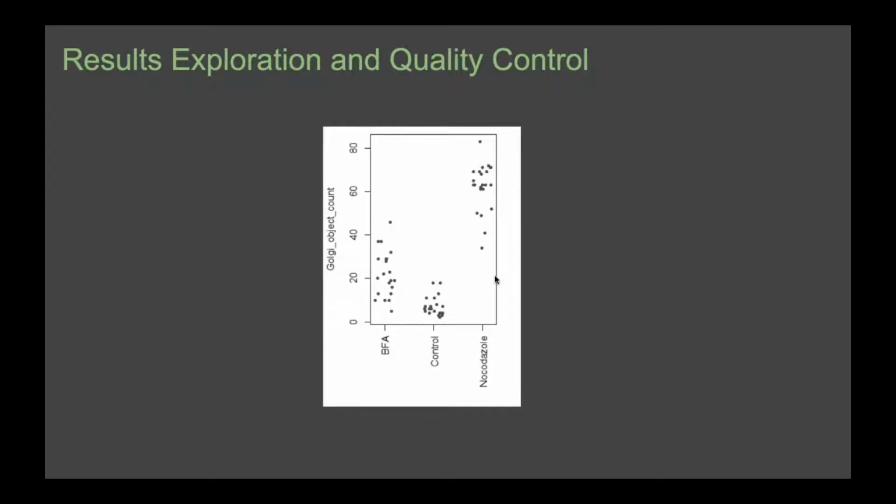Okay. Could you elaborate more about KNIME? Is it user-friendly or is some basic programming required? Unfortunately, I don't have a screenshot. It is user-friendly, so I think if some people have used LabVIEW, maybe not. So you don't have to write any code. In the end the workflow is little graphical icons on your screen, and you go from one step to the next with a little cable between them. So it's very visual, so no programming.